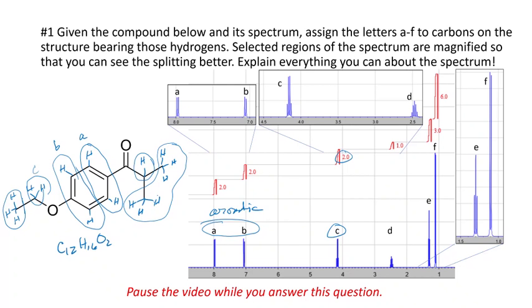That's our CH2 then. D is a signal that's split many times, and if you look really carefully up here, you might be able to see that that signal is at least 1, 2, 3, 4, 5, 6 lines. In fact, it's 7 lines. It's hard to see the little wings of those sometimes, but that's because it's this one over here next to the carbonyl group. Remember that anything to the left of 2.0 a little bit is a hydrogen on a carbon next to a carbonyl group. So that's what we have here.